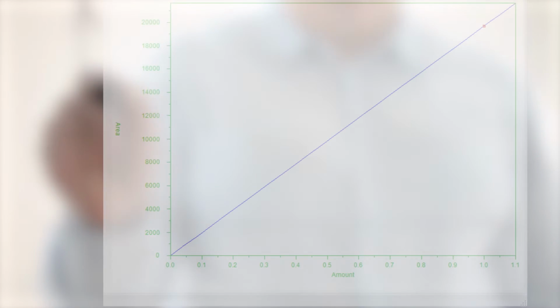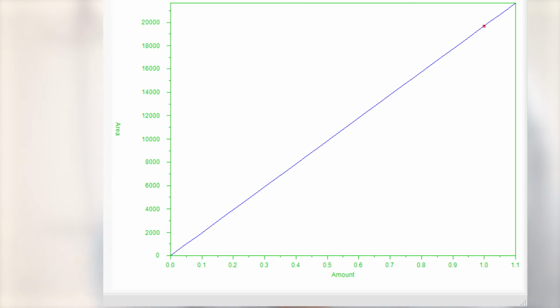For example, mathematicians consider straight lines to be one particular type of curve, and so we will use the term curve to refer to what is obviously a straight line. Following common practice in mathematics texts, this chapter posits a series of calibration models, starting with a simple model and developing more complex models as new features are introduced. These models are meant to represent real laboratory situations, but the actual numbers used were chosen to illustrate particular features. For example, peak areas are often round numbers. This of course would never happen in real laboratory chromatograms.